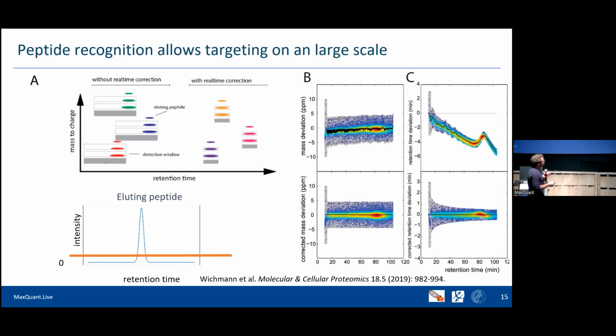So we have here, for example, the retention time deviation between two runs. And there is also this function which is now running in real time. It's doing some statistics, and then it sees, okay, they're all eluting a little bit later. Let's shift it. And the effect is that we can make this window much tighter because we now know when they will elute. They will be shifted, and we can say, okay, we don't need this 1 minute, but we only need 10 seconds or even less.